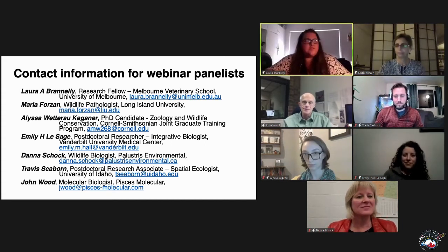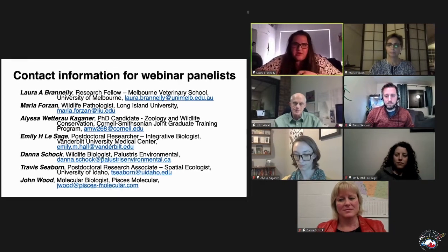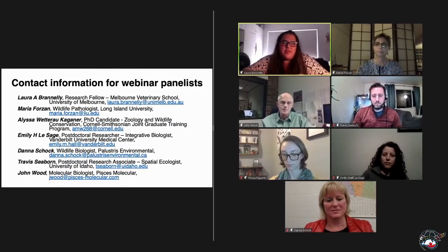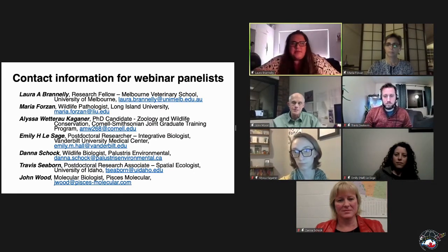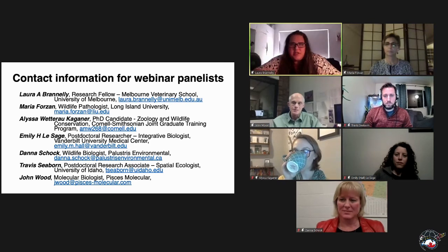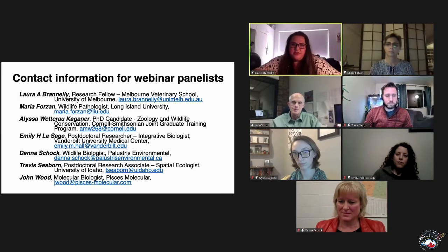I want to talk about just my personal experience with these different storage methods. I personally like the freezer one. You can pre-process when you get the filter, especially if you do it in a lab, you can get them in tubes and they'll be ready to extract. With the drying filter, like using silica beads, I guess this depends on which filter you're using, but the ones we were using got really brittle and had a lot of static electricity. So it was actually kind of difficult to get them into the tube for extraction. So just for ease of the person doing the extraction, that might depend on what sample storage method you use.